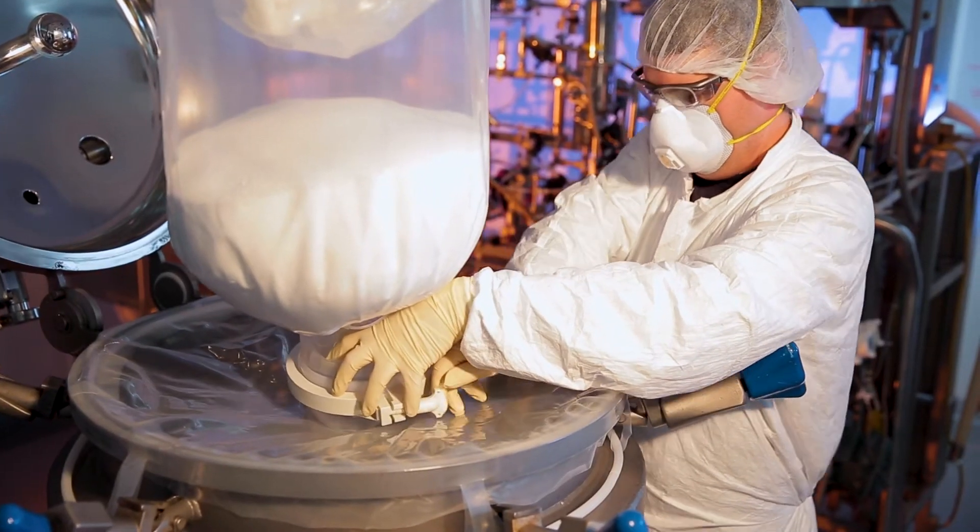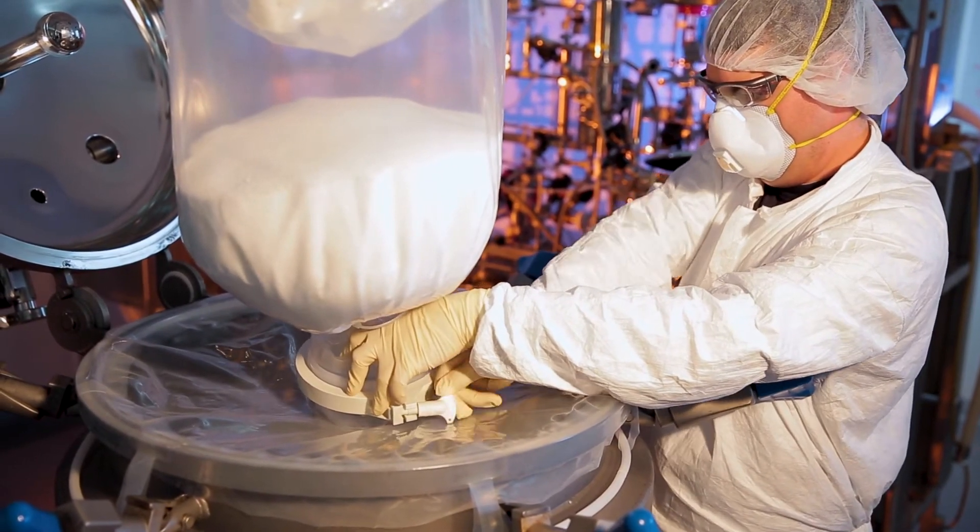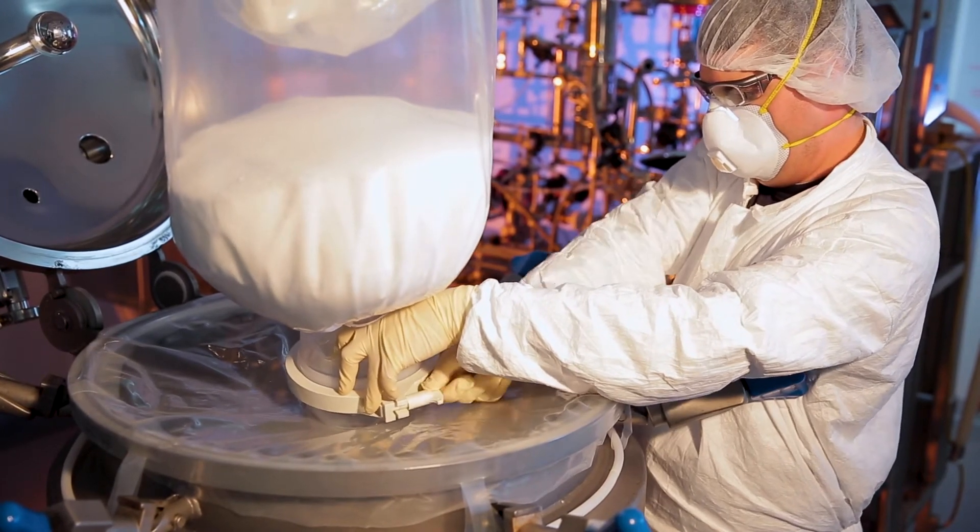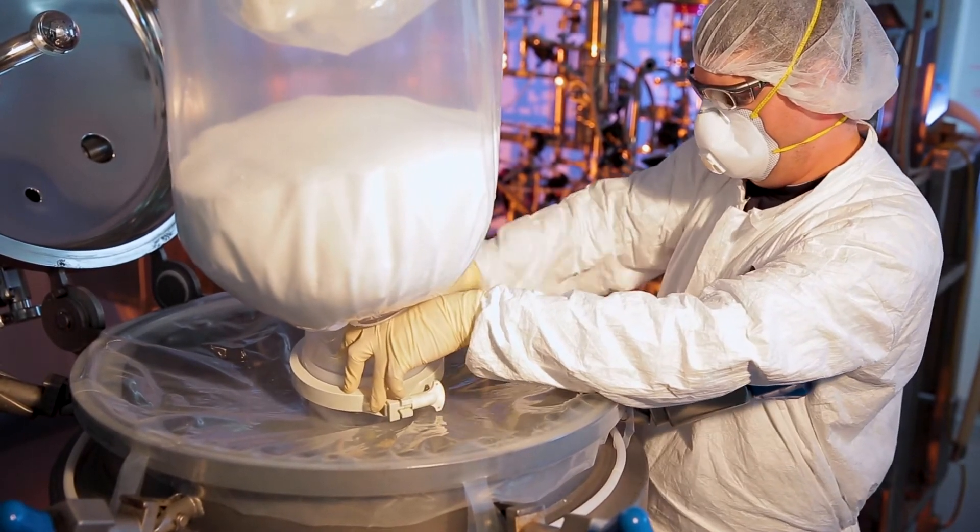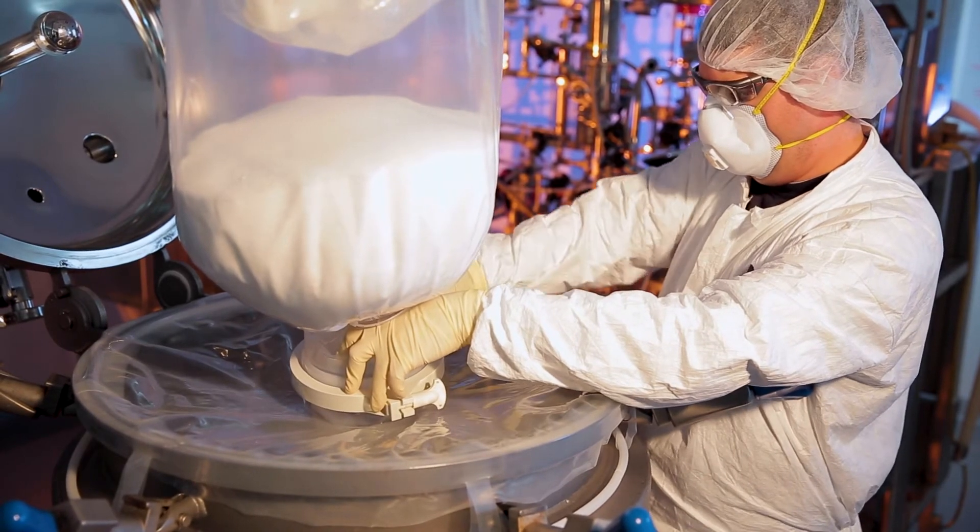To cover the full range of manufacturing needs, EZ-Biopac bags are available in a range of capacities from 1 liter up to 100 liters, with sanitary flange sizes ranging from 1.5 inches to 8 inches.